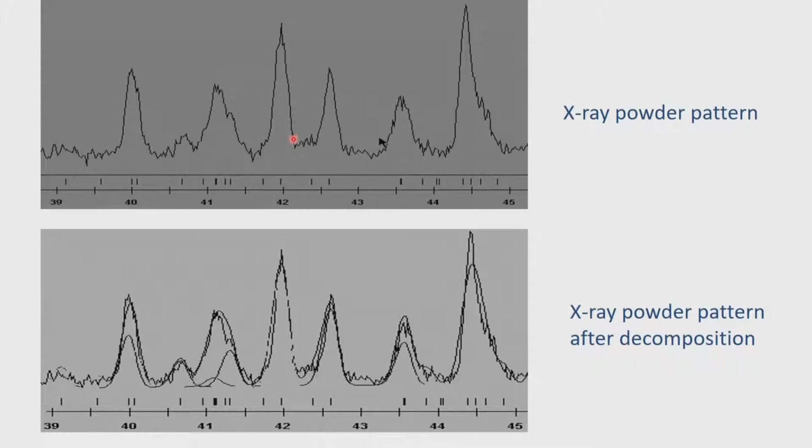So to do that, there is a procedure called pattern decomposition. This is an illustration of how one can do this. I am not going into the detail of how it is done because of lack of time. We are almost coming to the last couple of hours of the entire length of the course, so we cannot spend time on that, but essentially I will tell you how the breakup is done. The breakup is done by trying to develop the shape of the profile. So we do what is known as a profile analysis.